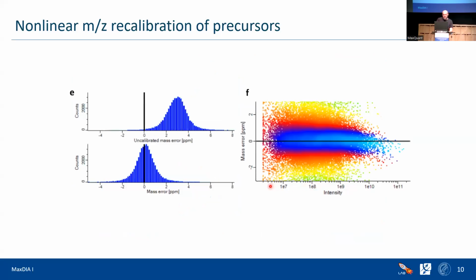Here you see that the distribution of errors, as a histogram, is also centered to zero by the workflow, and the width of the error distribution becomes much narrower than without applying the bootstrap workflow.